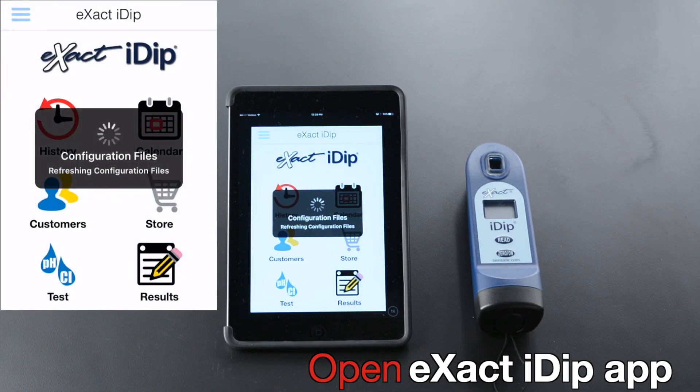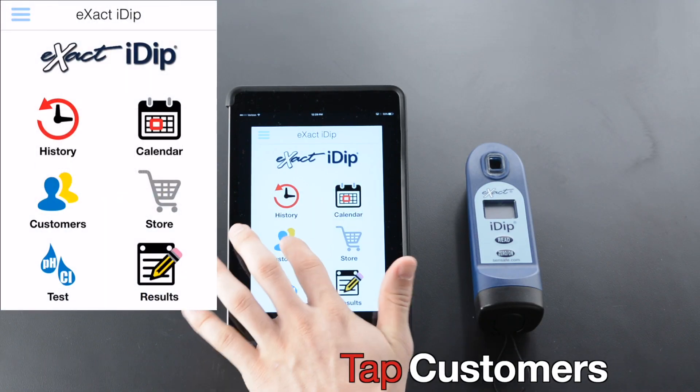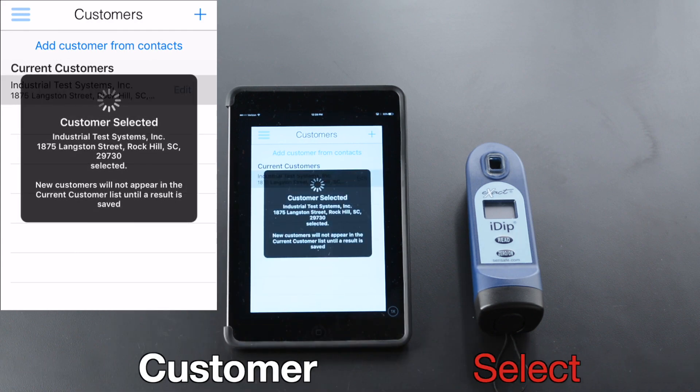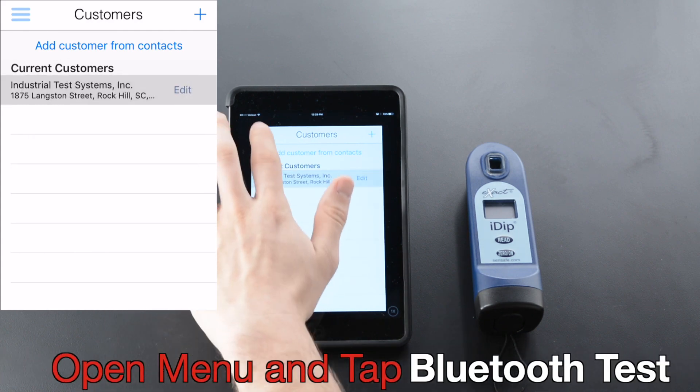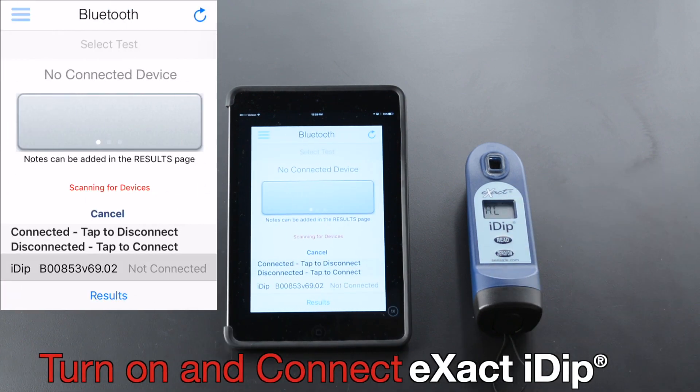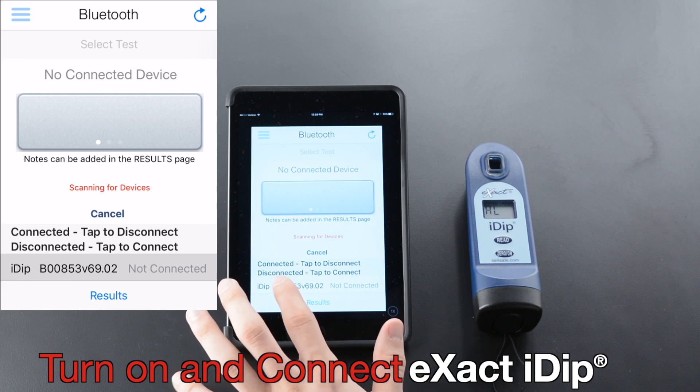Open the Xact iDip app. Tap Customers, select Customer, open Menu, and tap Bluetooth Test. Turn on and connect Xact iDip.